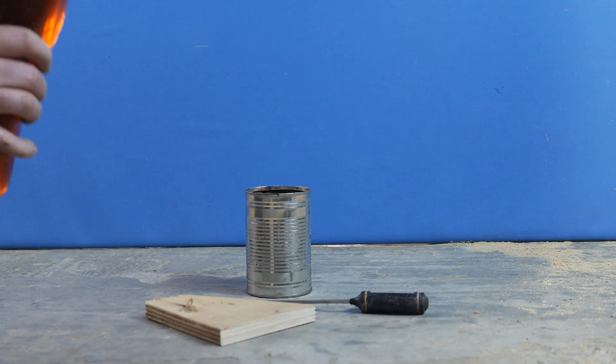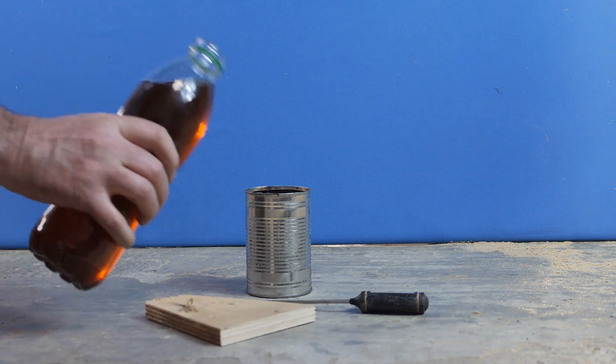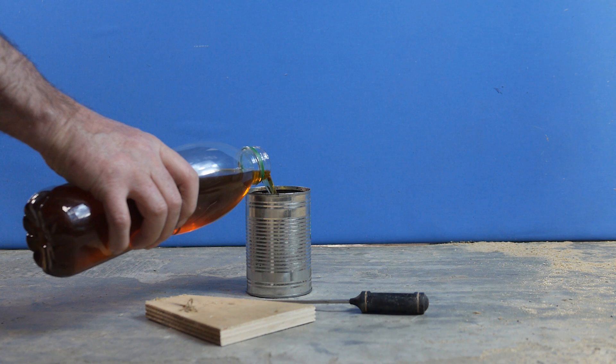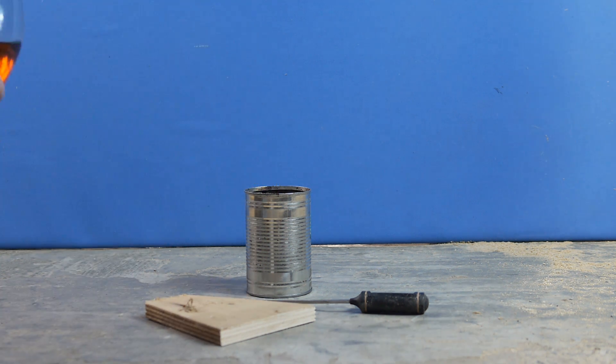Half fill the can with the fuel sample. Once you've finished that, put the cap back on and move the sample well away from the test site.